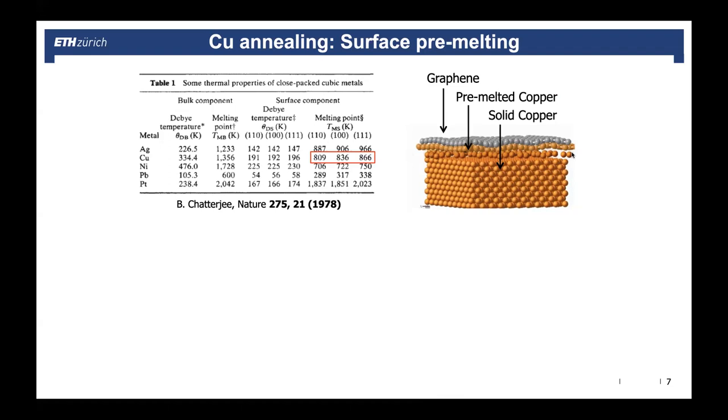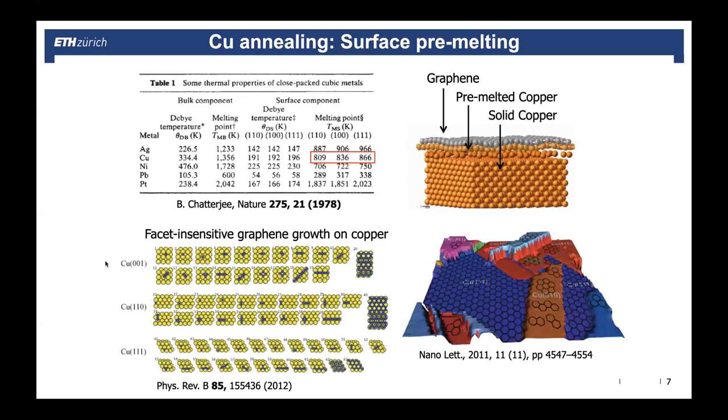So the graphene actually grows not on a static, fixed copper surface, but on something that is already quite dynamic. And this is good to know, because people have, of course, tried to understand how graphene grows. So you have a hydrocarbon, this decomposes, you have the carbon atoms, and then how do you form the first seed? How do they attach? So they use some kind of DFT calculations. Anyhow, that's a zero Kelvin ground state calculation. Maybe they could take into account some temperature effects. But anyhow, they did simulations for rigid structures.